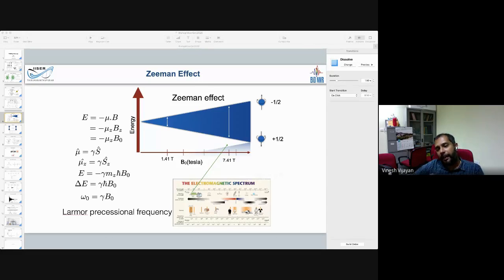For spin higher than half, like deuterium or boron and other nuclei, boron has two isotopes with spins 3/2 and 3, I think. Boron-11 is 3/2, which is what we normally measure.